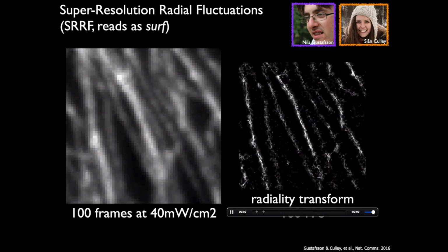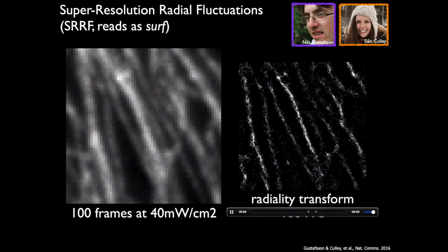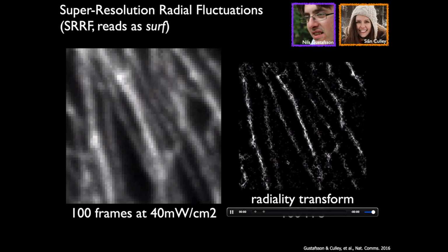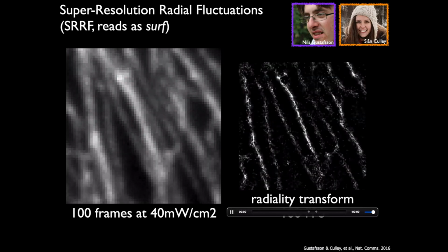So we have to get rid of that, right? We need to then improve these maps to only get intensity where there's a considerable likelihood of a fluorophore existing there. For that, we borrow concepts behind SOFI, where SOFI actually is really good at doing that.